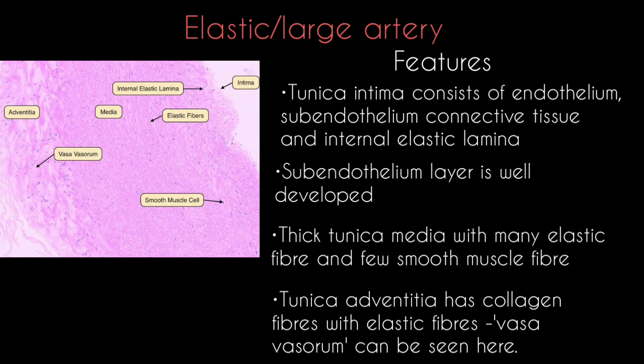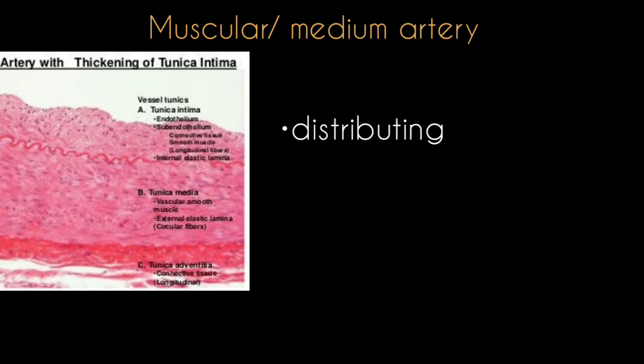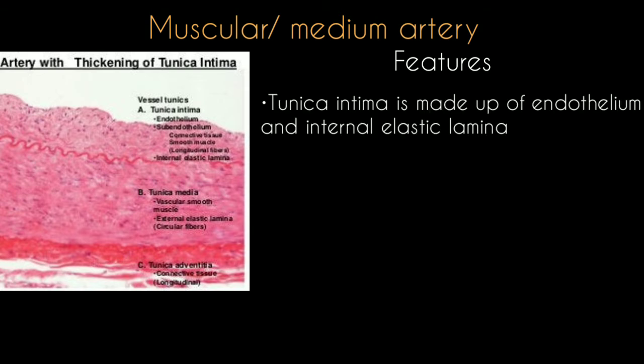The tunica adventitia contains collagen fibers along with elastic fibers. Vasa vasorum can be seen in the tunica adventitia — vasa vasorum are blood vessels that supply blood to these elastic arteries. Muscular arteries are also called medium or distributing arteries.